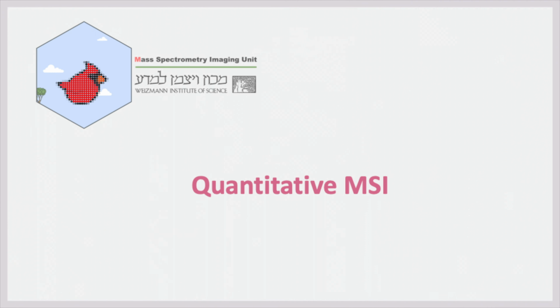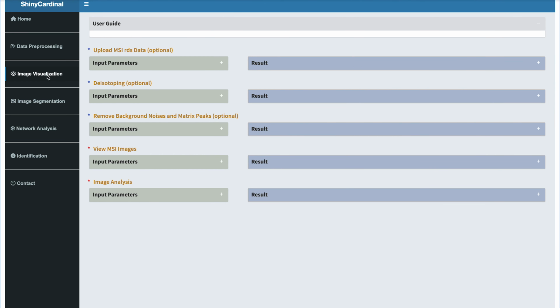This video tutorial is for quantitative mass spectrometry imaging. Most quantitative MSI experiments rely on standards of known concentrations. The use of internal standards could help correct for the region-specific matrix effects, and allow analyte signal to be converted into absolute surface concentrations upon generation of an appropriate calibration curve.